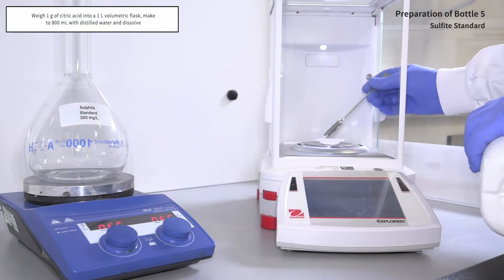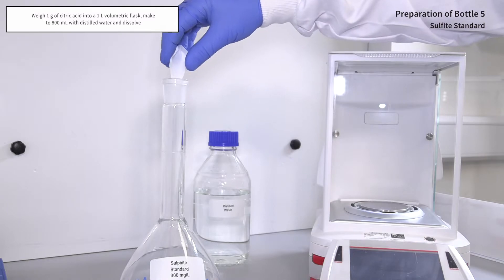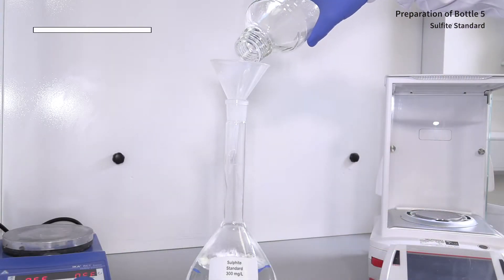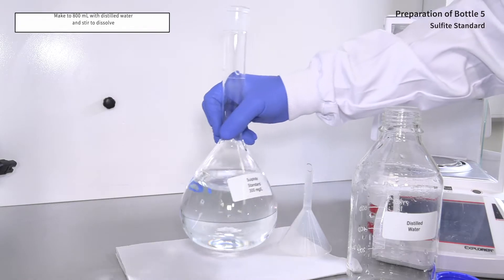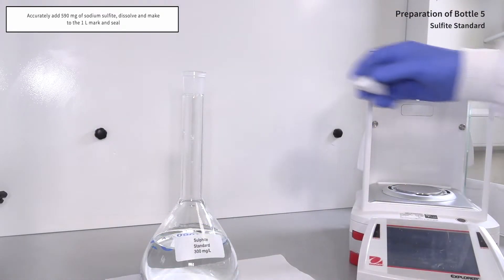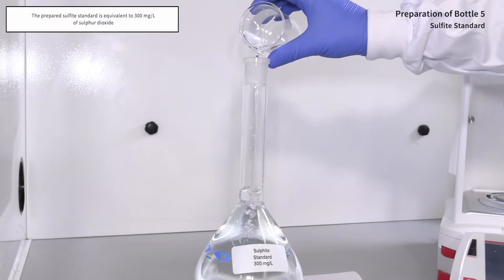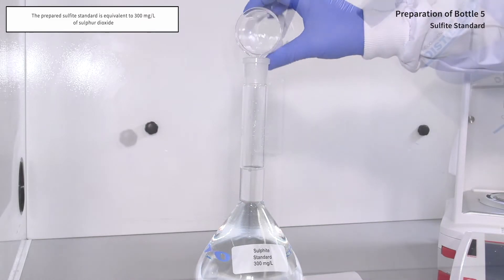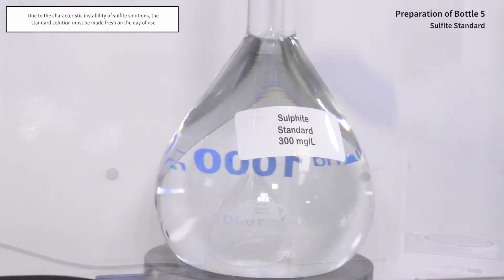To prepare the kit standard, weigh 1 gram of citric acid into a 1 litre volumetric flask. Make to 800 millilitres with distilled water and stir to dissolve. Accurately add 590 milligrams of sodium sulphite, bottle 5, and dissolve by stirring, then make to the 1 litre mark and seal. This sulphite solution is equivalent to 300 milligrams per litre as sulphur dioxide and should be used directly in the assay. Due to the characteristic instability of sulphite solutions, they will lose approximately 2% of the sulphite content per hour. Therefore, this solution must be made fresh on the day of use.